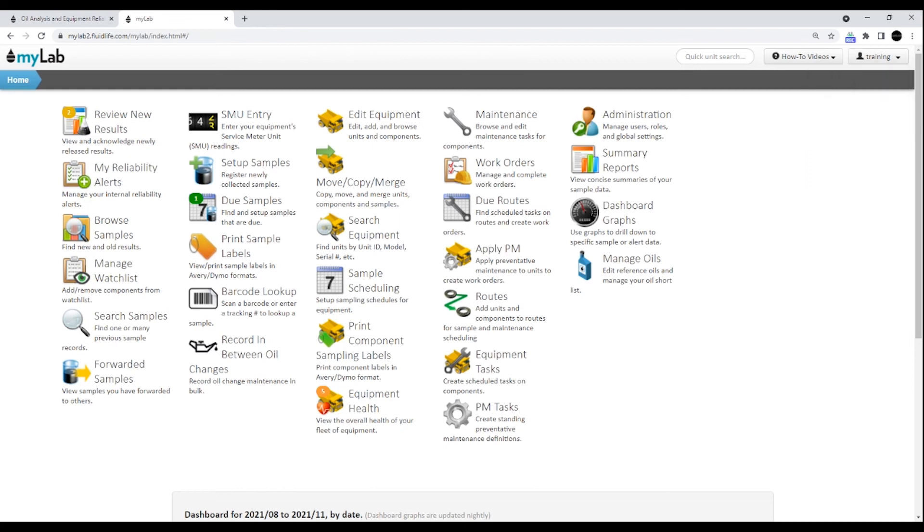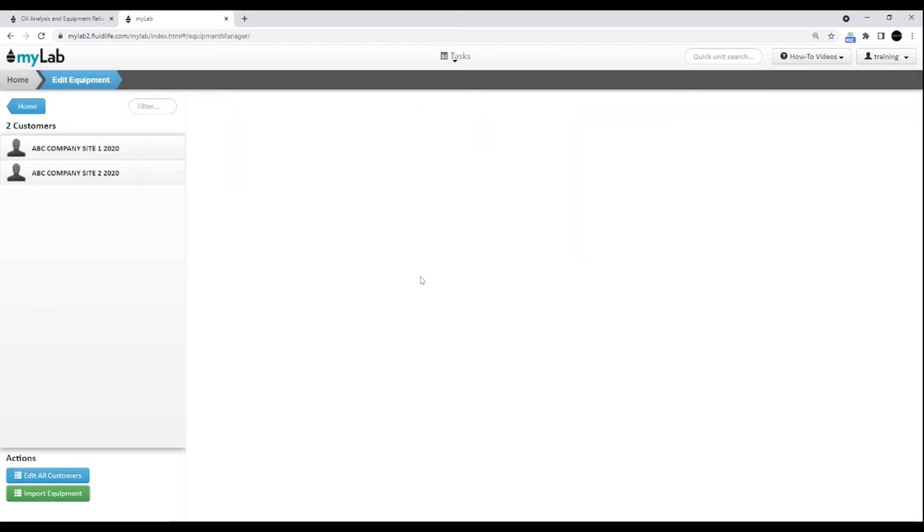Now let's do a quick example. Simply click on a task you'd like to perform. In this example, we're going to edit equipment. You'll now see that the edit equipment sign is added to your current location bar.